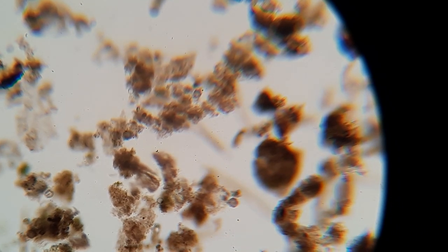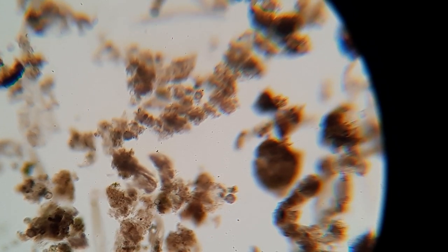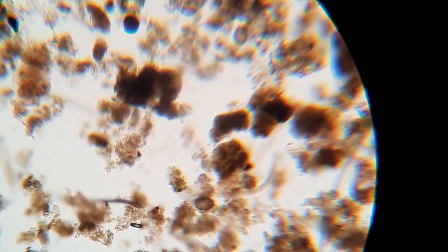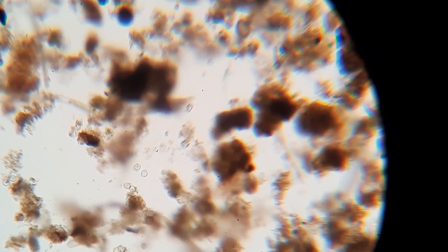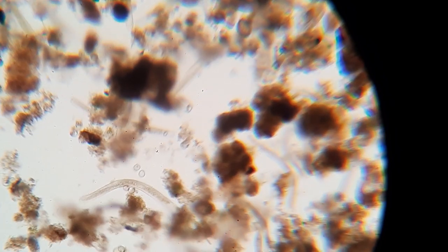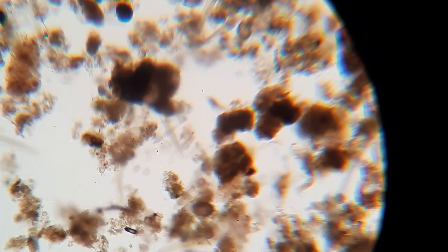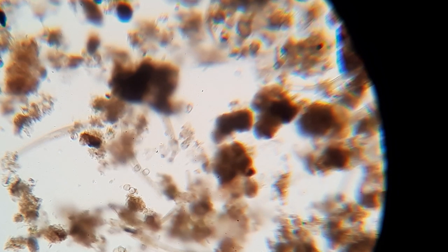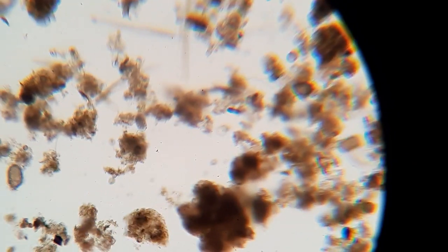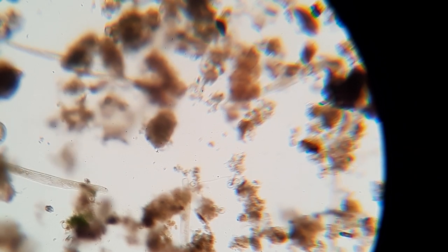Okay, this is a 10x objective, 10x eyepiece, and a little bit of magnification on the camera. I'm trying to get these things in focus, but I just do not want to... Holy crap, look at all this stuff. It looks like we've got nematodes and all kinds of things.